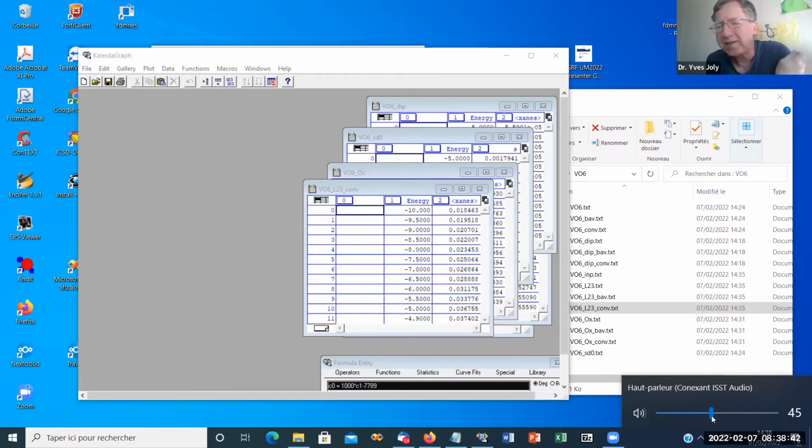Why is it done in that way? It's not only because it's stupid. It's because what we probe are excited states, and the Fermi level is a concept of the ground state. Because it's a DFT calculation and we are probing an excited state, there is some contradiction.